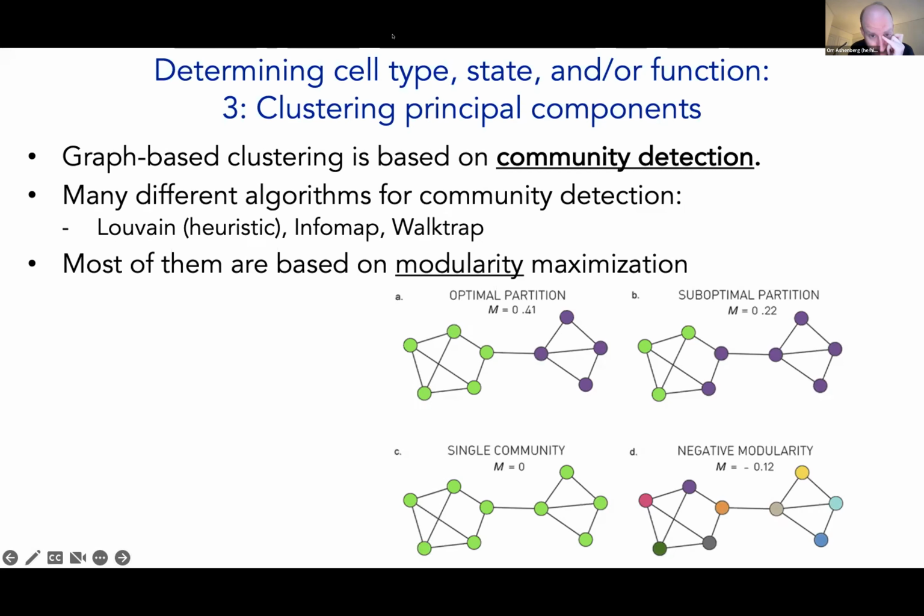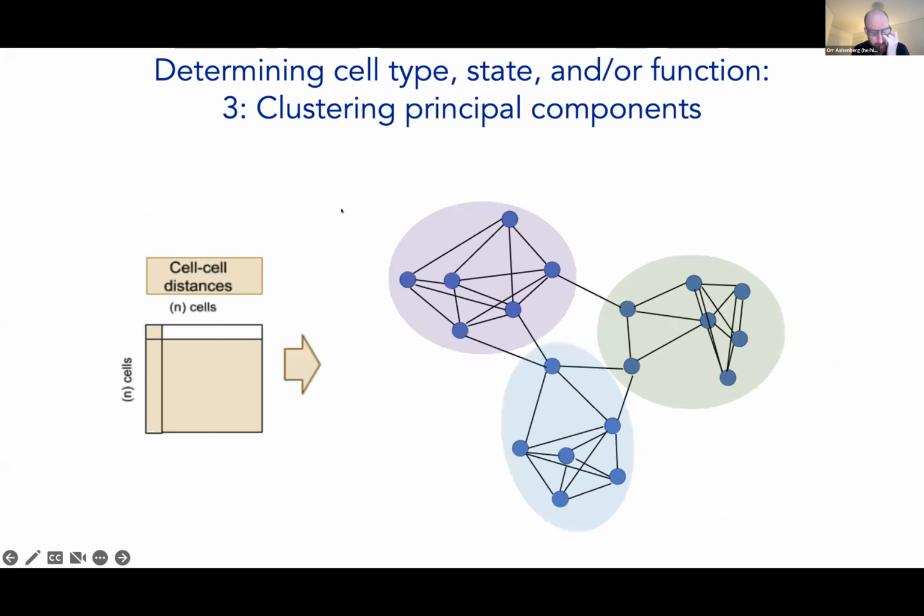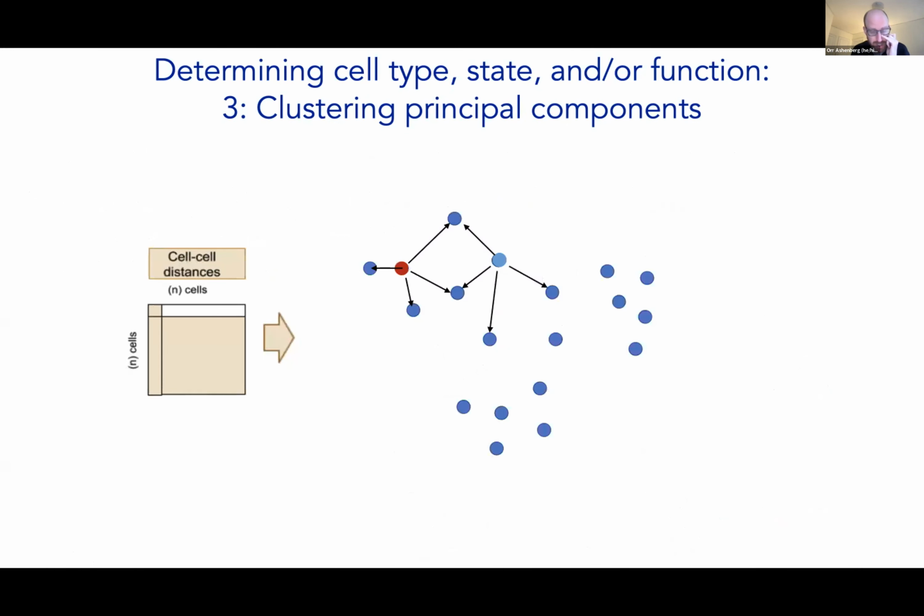And then thanks for the other question, Jelta. Sorry if I said your name incorrectly, but is the position of the cells random, or what is it based on exactly? The position of the cells in the graph is not random. This is really just a depiction in 2 dimensions of the cells.